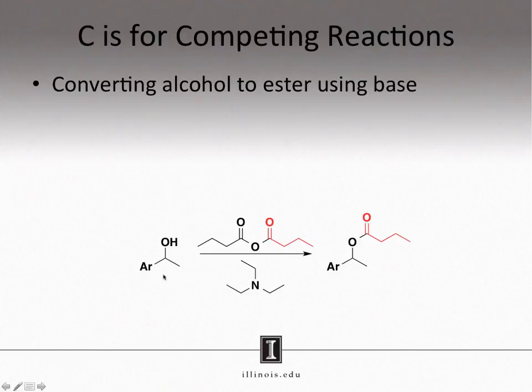This type of reaction often proceeds very quickly. However, under the particular conditions you will be using, this reaction is very slow. To accelerate or speed up this reaction, you will be using a catalyst, shown here in blue. This particular catalyst is called homobenzotetramisole, or HBTM for short. Do not worry about memorizing the full name, just recognize this molecule as being called HBTM.